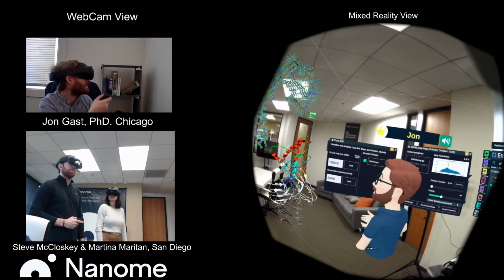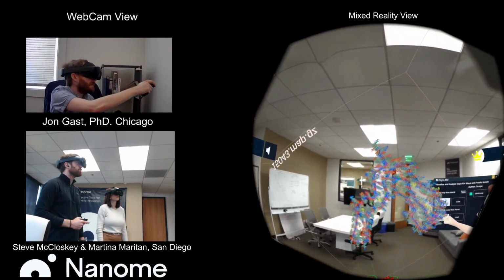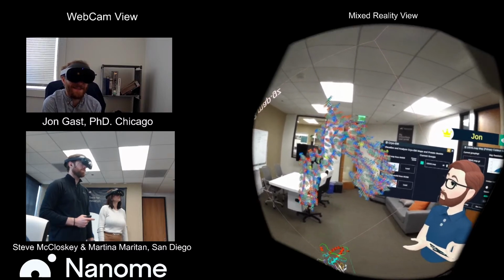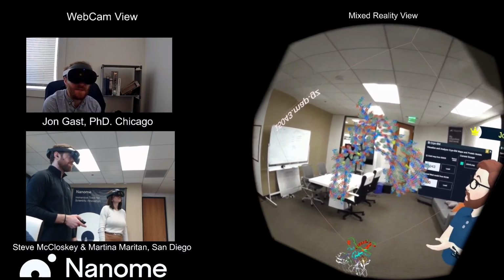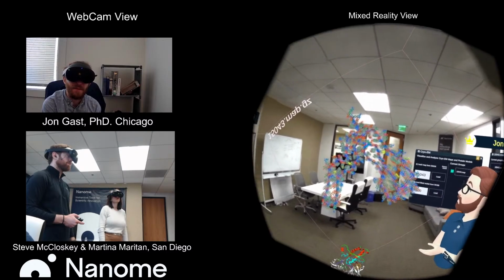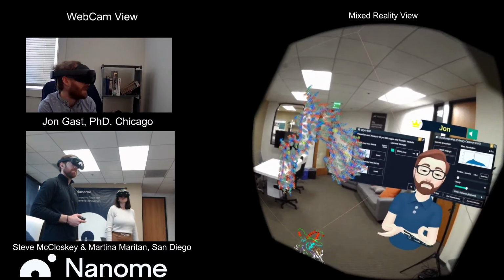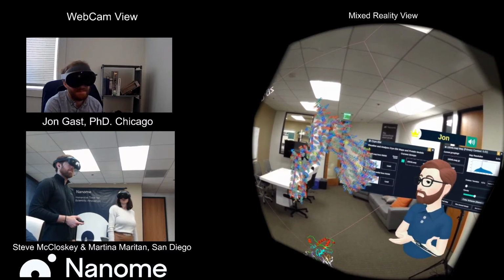Here's a somewhat data-related question: can you see copper methionine linkages in alpha-synuclein? I might have butchered that. Yeah, no, it's alpha-syn. Yeah, you got it. You absolutely could. If you have a headset, you can take a look in Nanome. We can certainly look for one now. It might take a little bit to load in, but absolutely. We are compatible with all sorts of metals and everything else. So if it comes in the map, we can certainly see it.